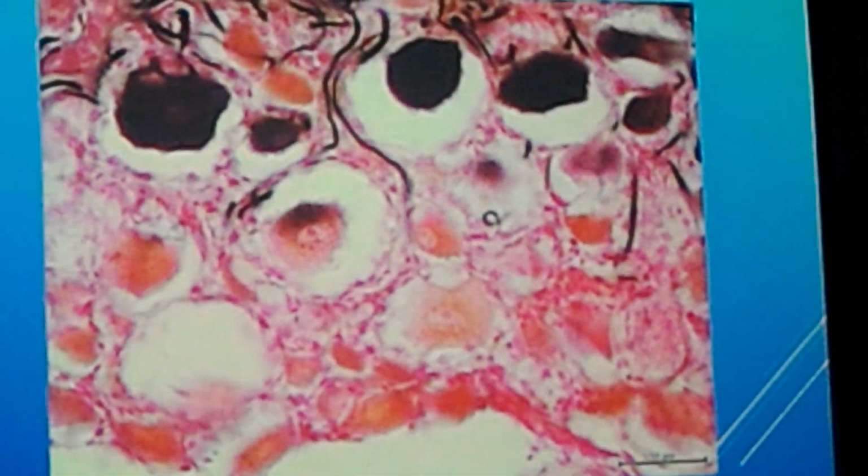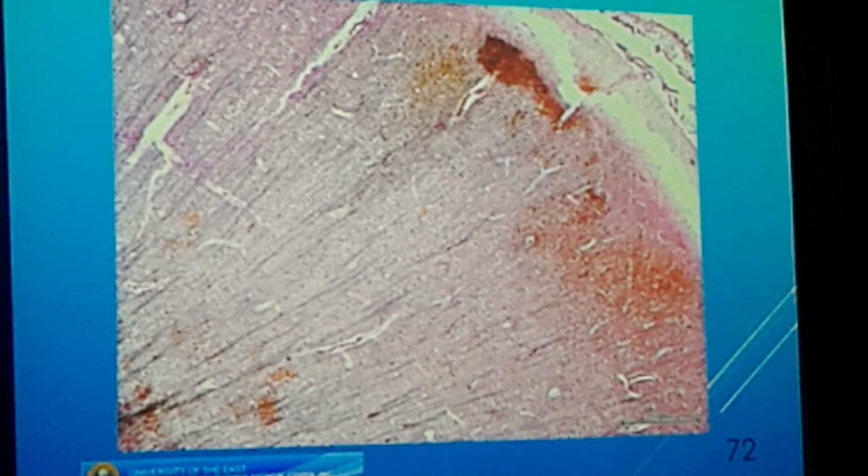Okay? That one is hard. Okay, this comes from the cerebral cortex. This is our concern. Dorsal.